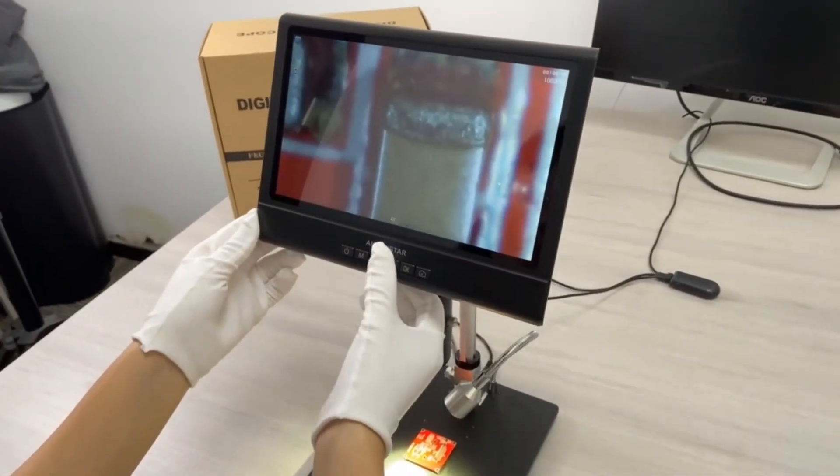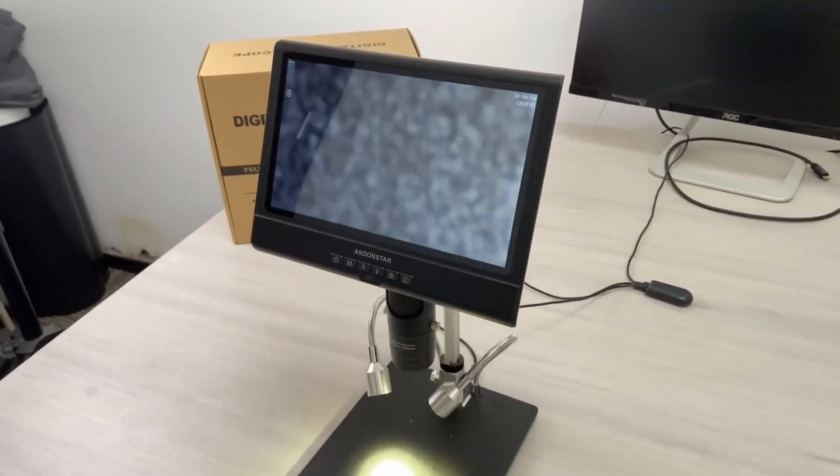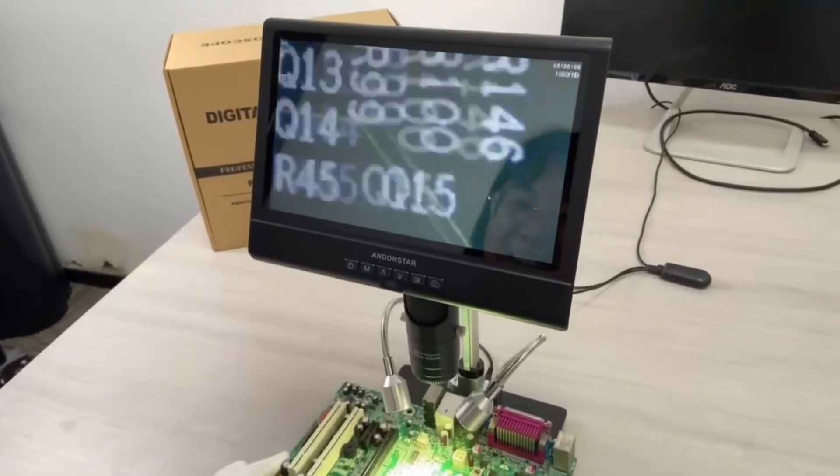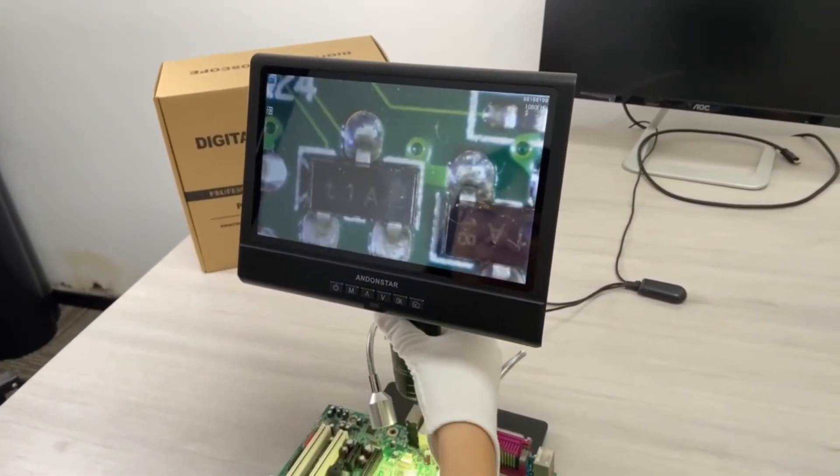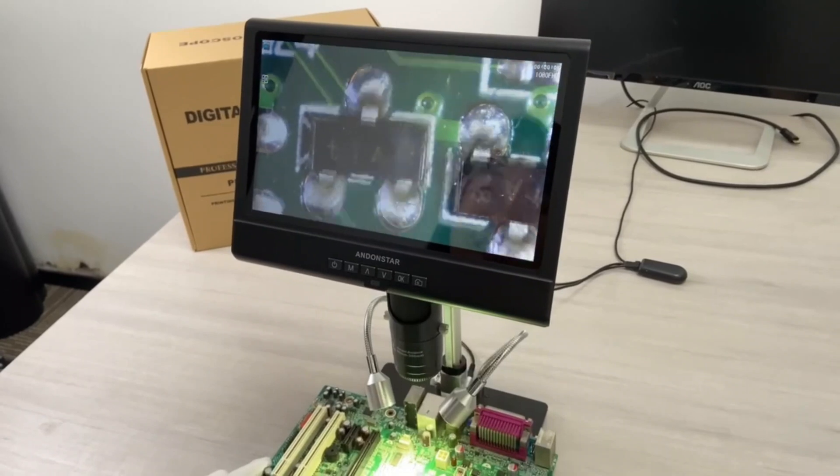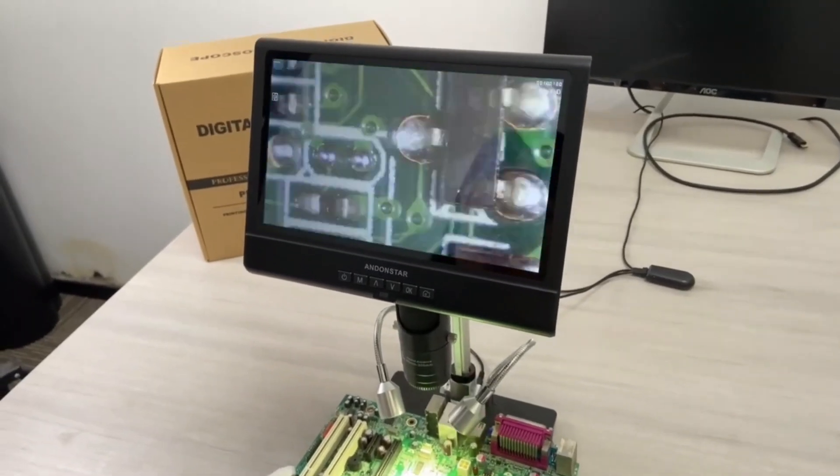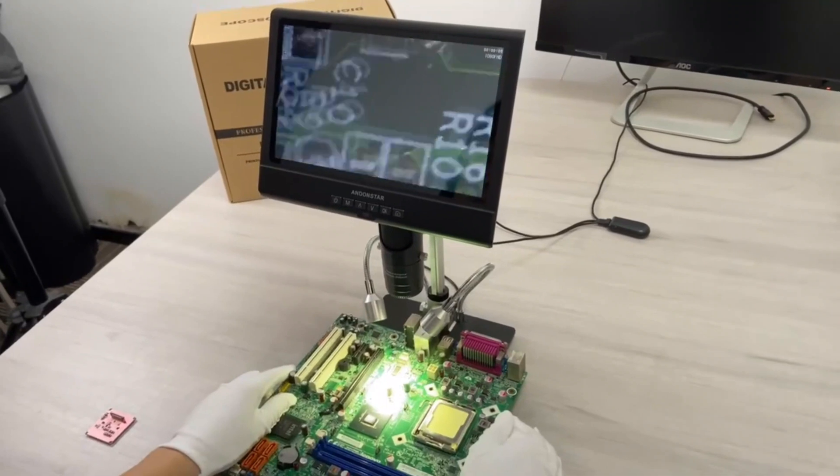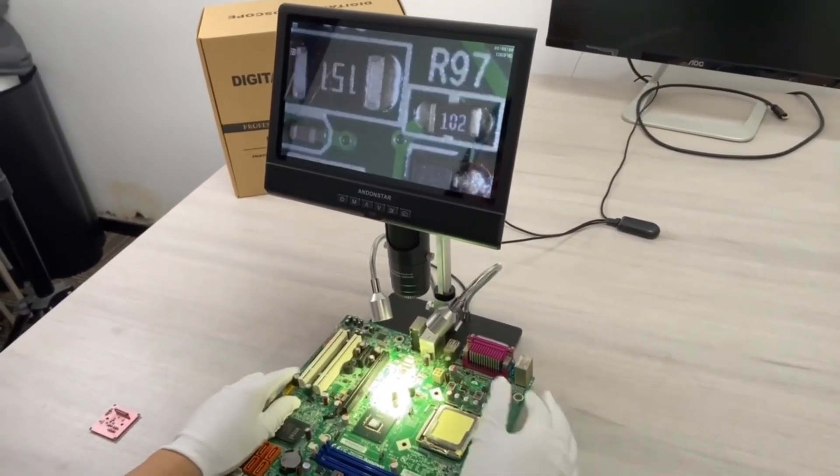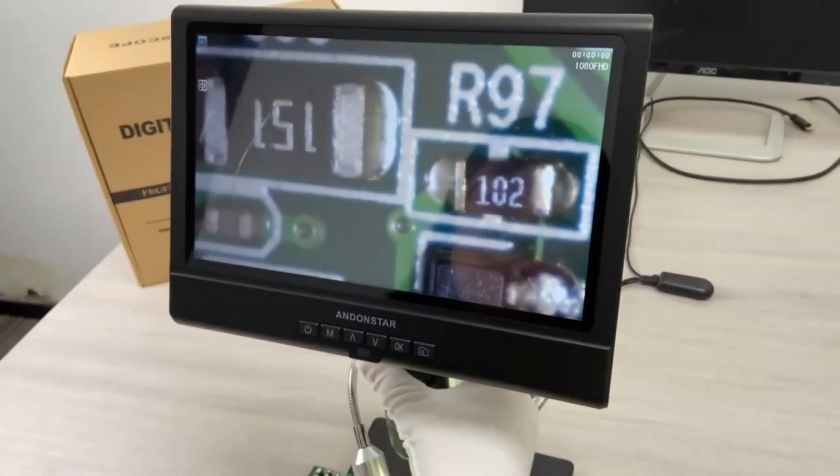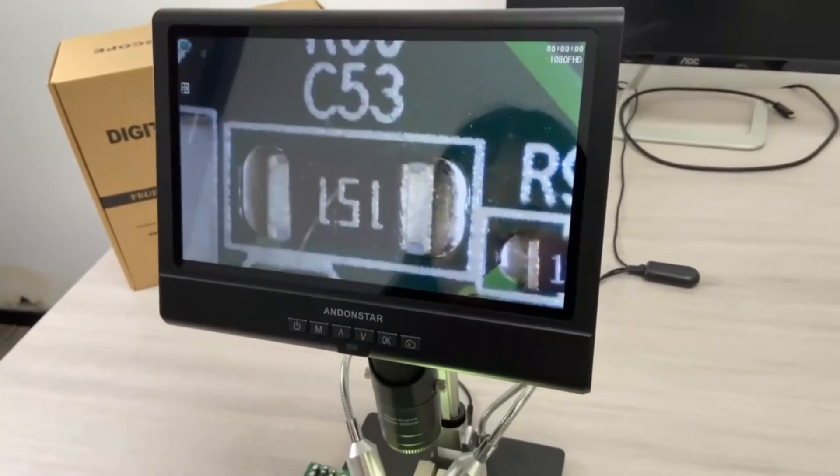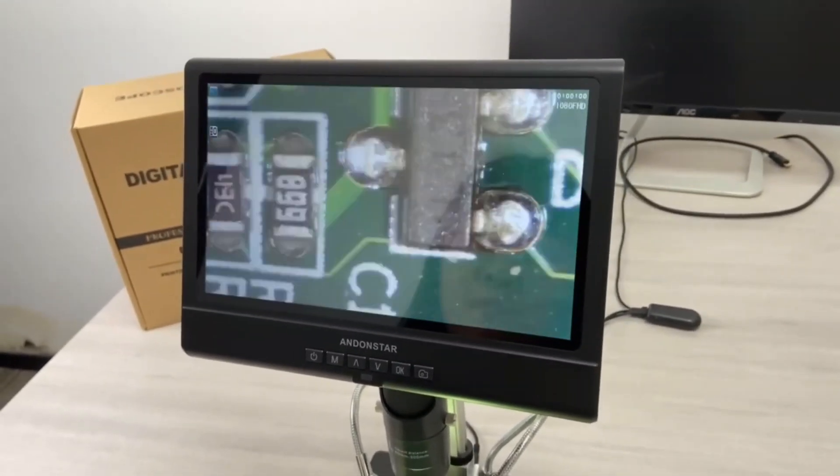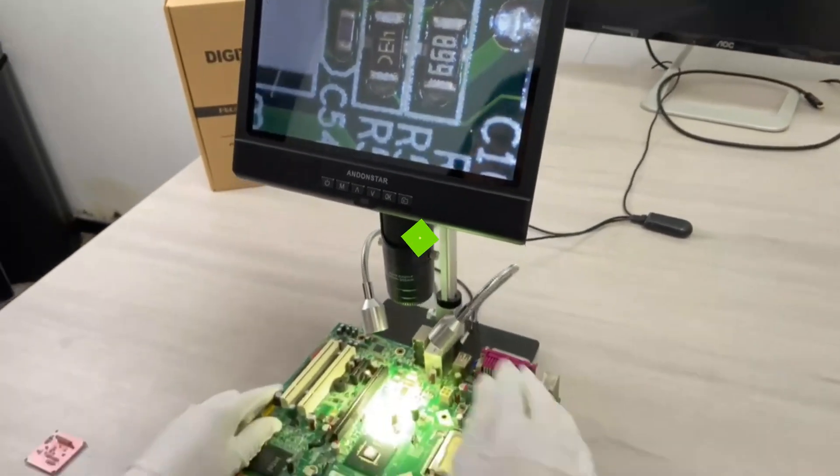The microscope also supports memory card recording and taking pictures, with video resolutions up to FHD 1920x1080 at 30fps, and a maximum photo resolution of 12M. It comes with two lenses, lens A 380x and lens L1 380x, each offering a different focus range for observing various objects.